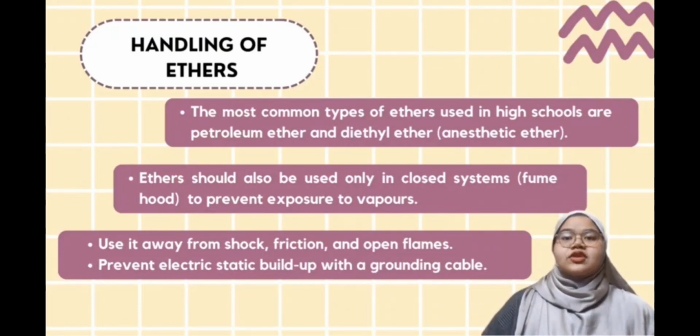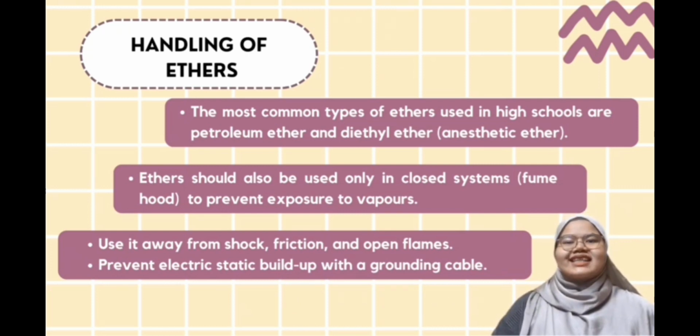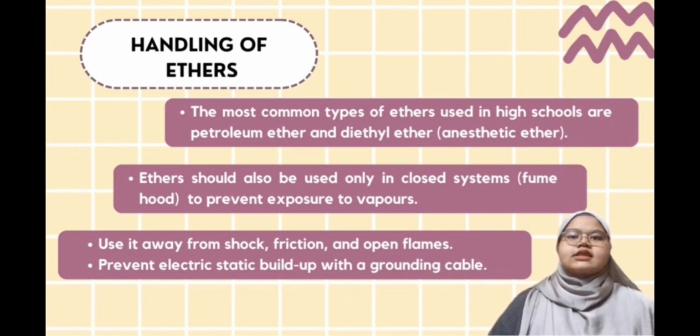Ethers are a class of organic compounds that mostly contain an ether group where the oxygen atom is bonded to 2 alkyl or aryl groups. The most common types of ethers used in high schools are petroleum ether and diethyl ether, also known as anesthetic ether. Anesthetic ether that has been stored for several years may form crystalline solids called ether peroxides on the inside lid of the container. Once peroxides have formed, this diethyl ether is dangerously explosive.